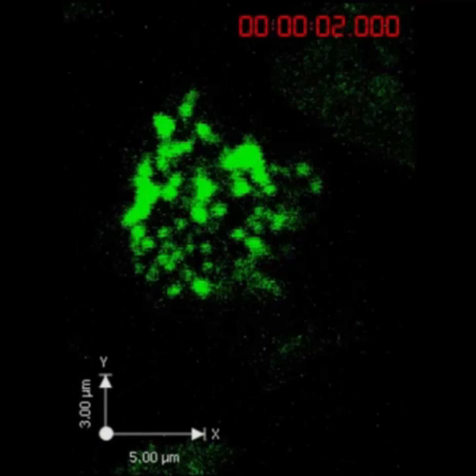In this particular clip we can follow a type of molecule that's present on the surface of an NK cell called a receptor, shown here in green. We can follow it as it reorganizes as an NK cell detects a diseased cell. This molecule is really important for this detection and for the decision by the NK cell to kill the diseased cell.